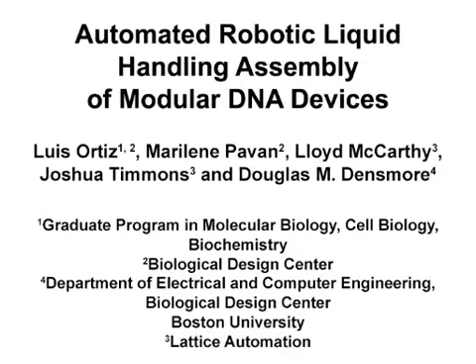The overall goal of this DNA assembly protocol is to enable the repeatable, scalable, automated, high-throughput production of DNA devices. This work addresses the need for a robust and user-friendly software workflow that can generate pipetting instructions for a liquid handler based on high-level DNA device designs.